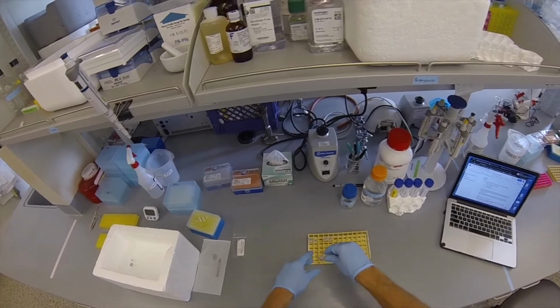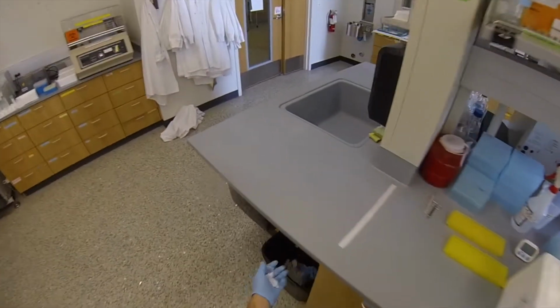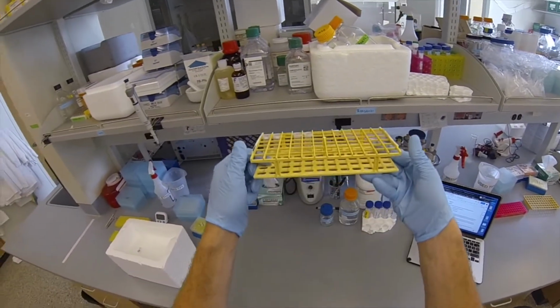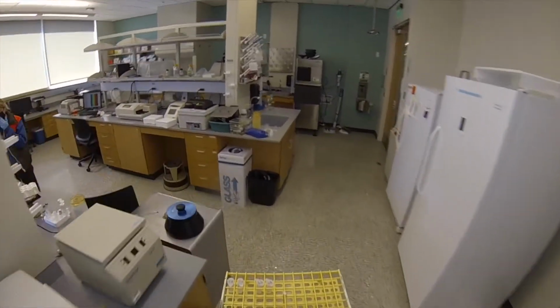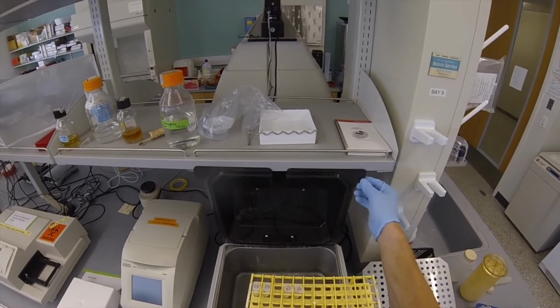You can now throw out the water and ethanol washes used on the tissue homogenizer. Make sure all of the tissues are fully homogenized and all of the samples are in the yellow test tube rack for the water bath. Bring the samples to the water bath and invert 10 times before placing in the water bath.